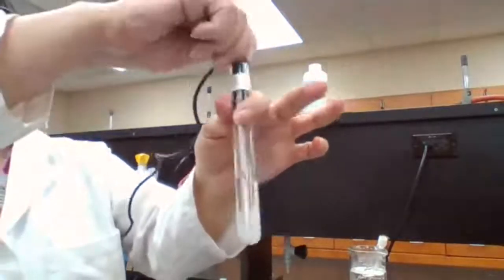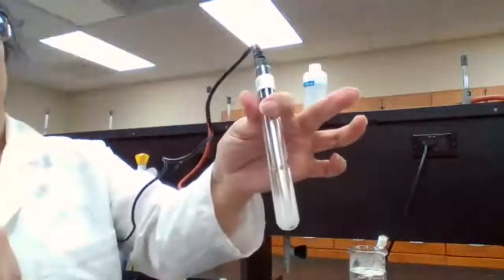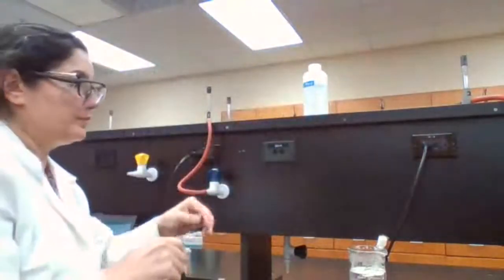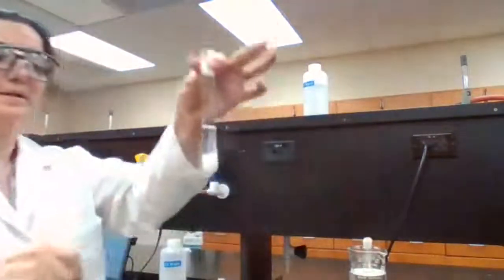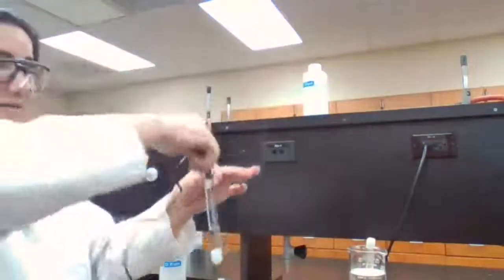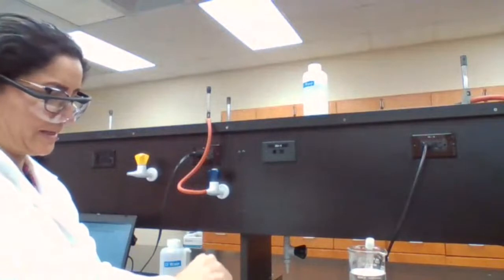So when the crystals are forming, I can move to the next test tube. Test tube number 3. You see, the temperature is high, but the solid is there because we haven't mixed it well. So we have to mix it well to make sure that it dissolves.